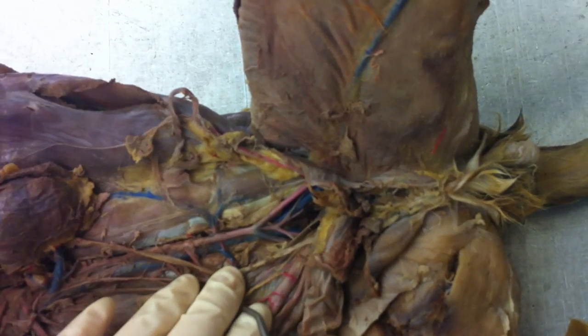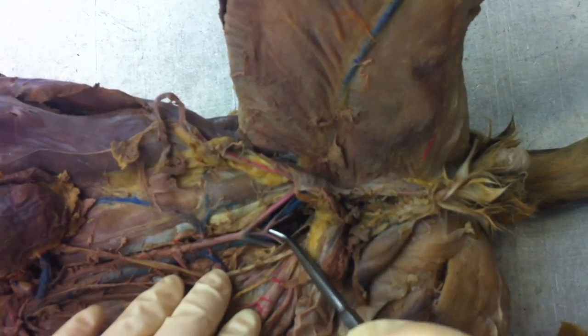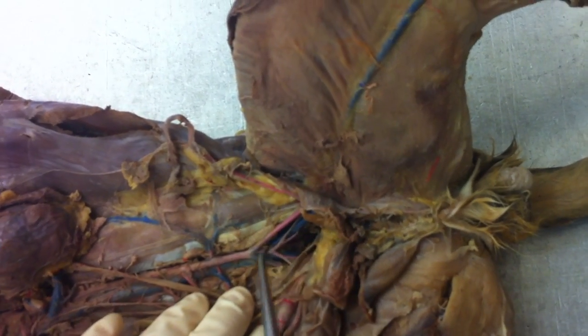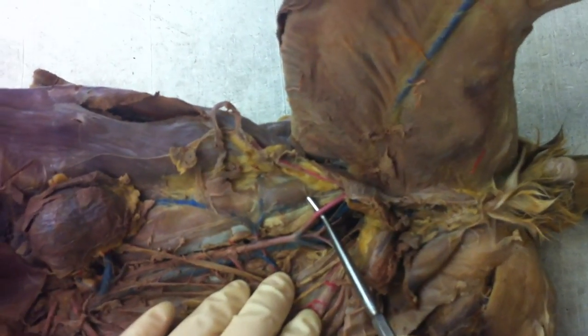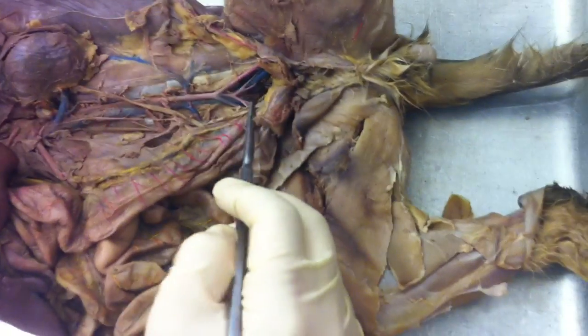Going to continue on down, and then you guys see this sort of double Y split or double V, right? Those are the iliac arteries. You're going to have external and internal iliac arteries. So, if I asked you to identify this, you would say that is the left external iliac artery. You'd have to have all of that for full credit, okay?